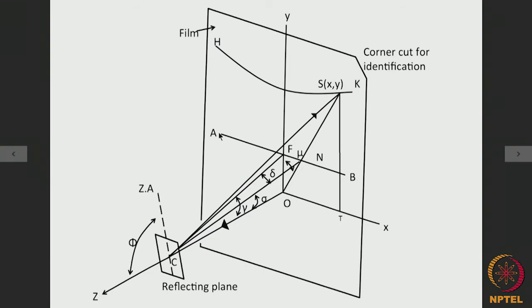If we look at this particular diagram, for this particular zone of planes, the diffraction spots will appear over here and the plane normals will appear on this line. So, for this particular zone, the plane normals will be tilted away from this line by an angle gamma, and for this particular spot it will be shifted from the center by an angle delta.